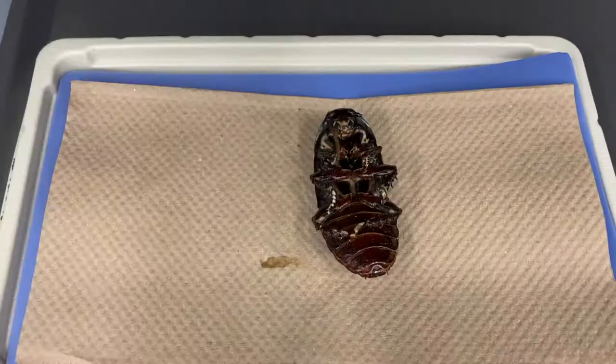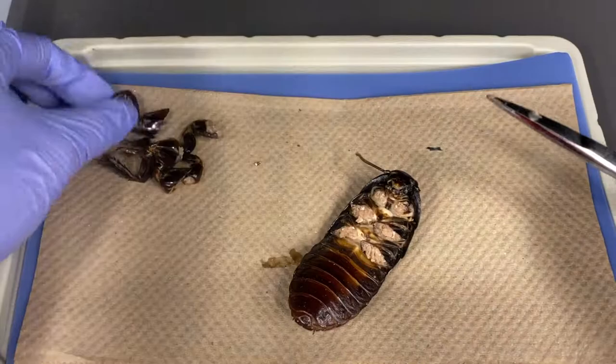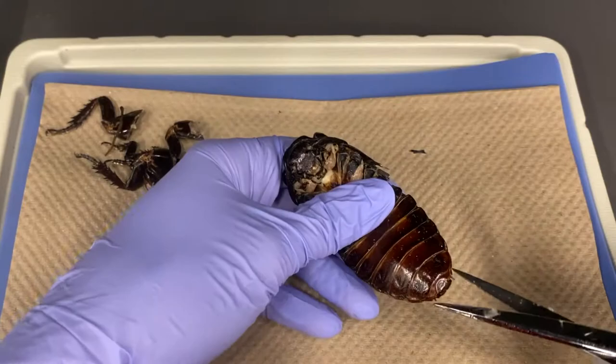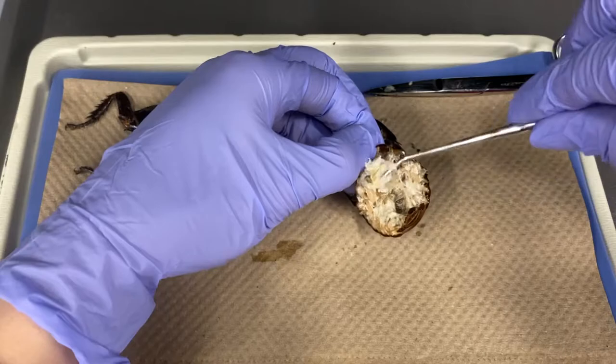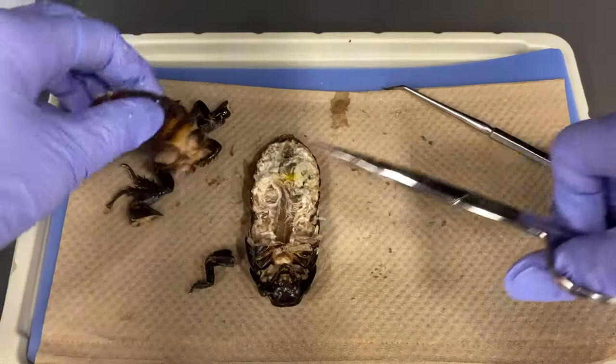Let us now prepare for dissection. Place the cockroach ventral side up, and then with scissors, remove all six legs. Insert your scissors between the last abdominal segment and cut towards the head along the side of the exoskeleton. Do this along both sides. Peel back the ventral part of the exoskeleton, using a probe to help detach it from the rest of the internal structures. Remove the ventral exoskeleton.